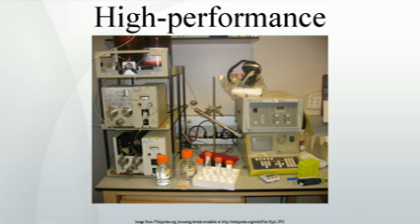In many cases, baseline separation of the peaks can be achieved only with gradient elution and low column loadings. Thus, two drawbacks to elution mode chromatography, especially at the preparative scale, are operational complexity, due to gradient solvent pumping, and low throughput, due to low column loadings.